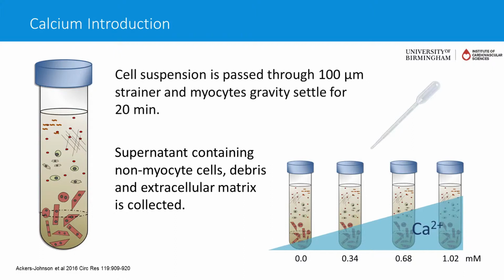Sure. One thing that I would like to get your opinions on, both of you, is that normally when we sediment, we use 50 ml Falcon tubes, and you will see the pellet of cardiac myocytes forming at the bottom. Now, we tend to put the tube slightly on its side to increase the surface area of that pellet so that we reduce the chances of hypoxia. Is that something that you have experienced as well? And would you recommend that to others? Or is this just one of these strange things that we do and think works, but potentially is not implemented in other labs?